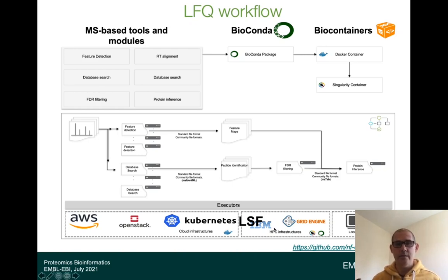But mainly, the desirable architecture is basically the cloud architecture. For example, cloud or HPC architecture, or distributed architectures in general, where you can send each specific task to one node and get back the result. What is the benefit of that?